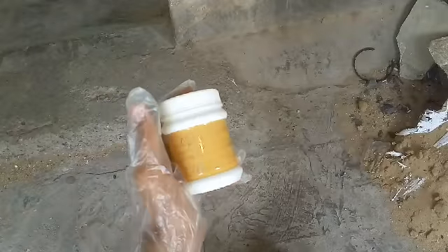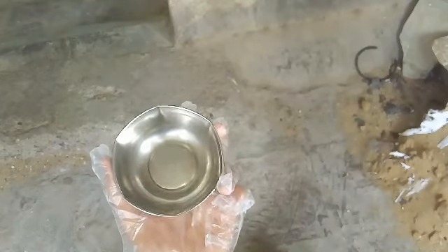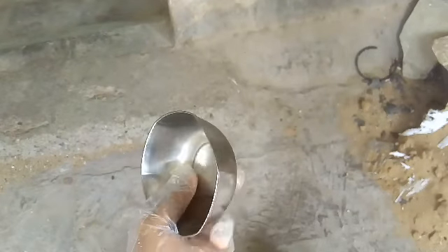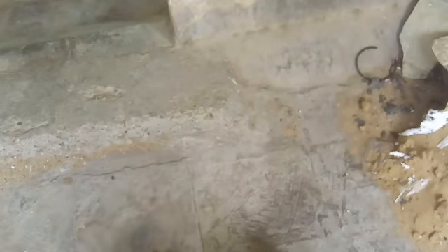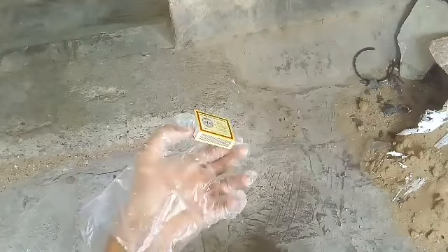Okay guys, so I'm outside here in an open, well-ventilated place, and for the generation of the carbon, let's proceed with the experiment. For this, what you're gonna need is this naphthalene ball. I have it in my container as balls like this, and we're gonna need a metal cup to collect the carbon. Always use a stainless steel or metal one. Do not use aluminum, plastic or glass, because plastic will melt and the glass will shatter, of course. You're gonna need a pair of gloves for protection, a match, and a fire extinguisher nearby.